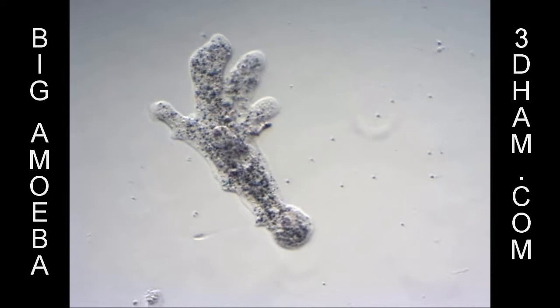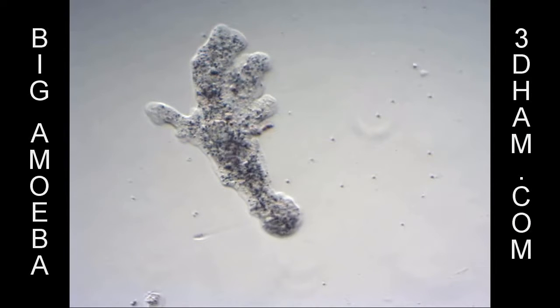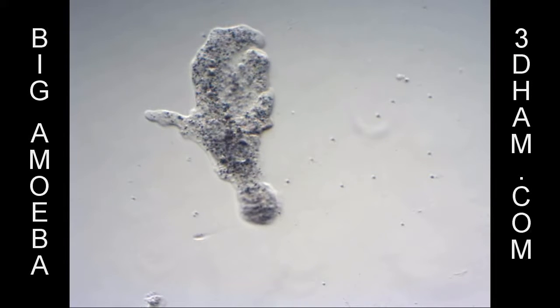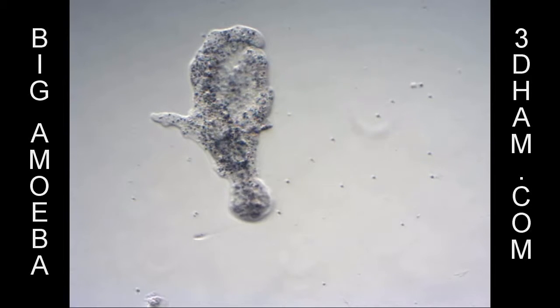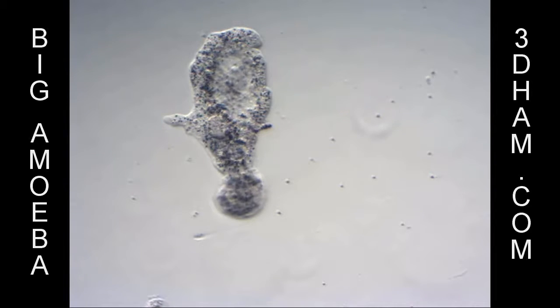Amoeba are just one of the many fascinating organisms you can find in a hay infusion. And making a hay infusion is quite easy. Just add some grass and some dirt to a small container and add some dechlorinated water, either aged tap water or some sort of bottled water, and then watch it as it develops. You'll be fascinated by the way the community of organisms changes as the culture matures.